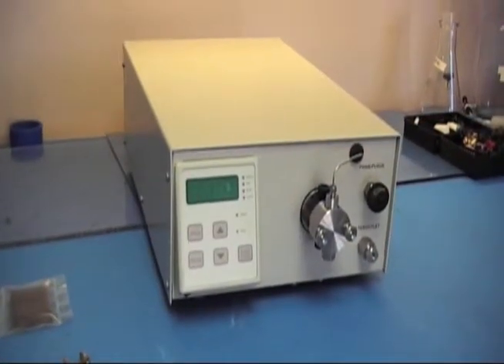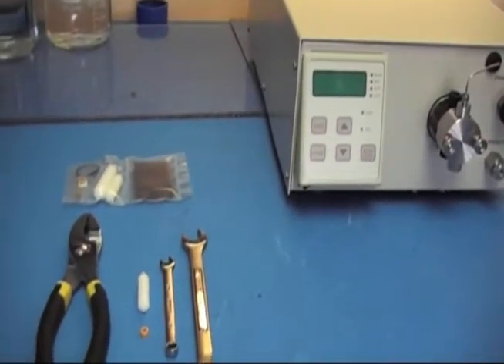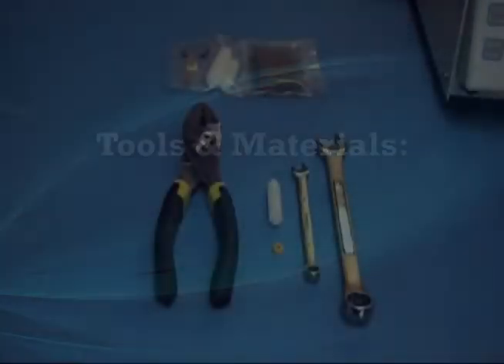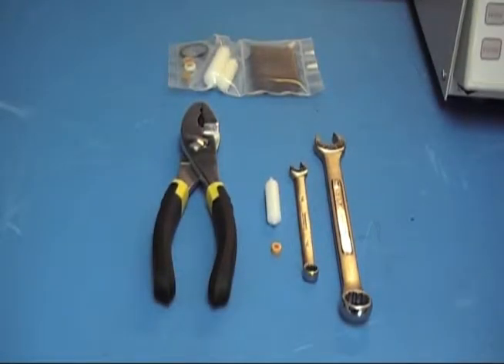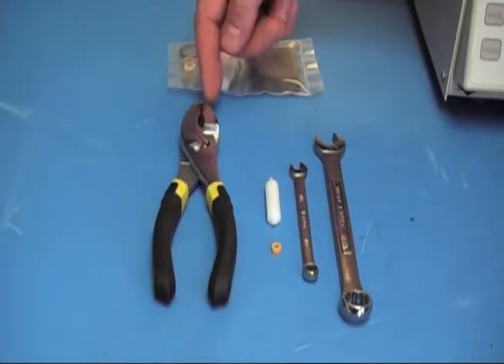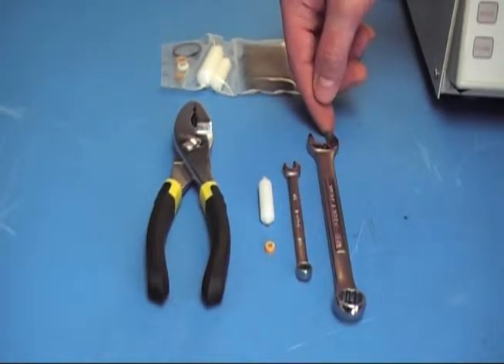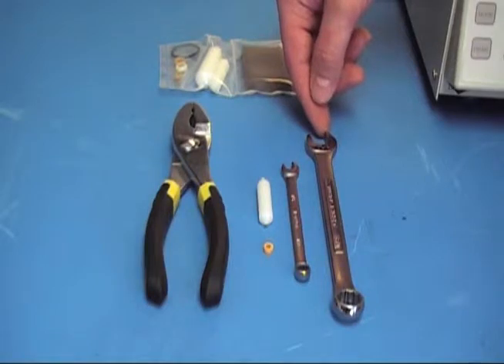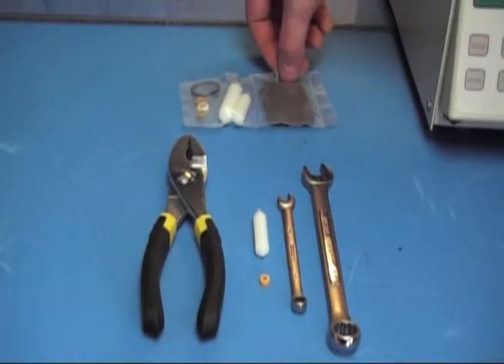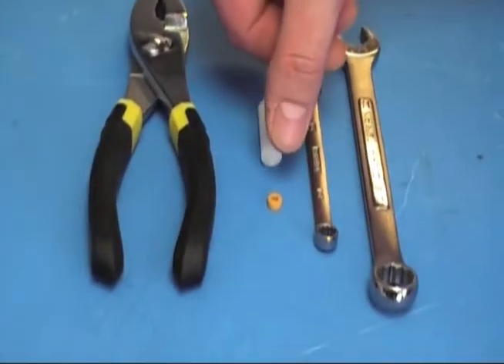This is a seal procedure for a Series 3, 10 mil, stainless steel pump. The tools recommended for this procedure are a pair of pliers, a quarter inch wrench and a half inch wrench. Materials you'll need that are provided with the seal kit are the seal install and removal tool, and the actual seal itself.